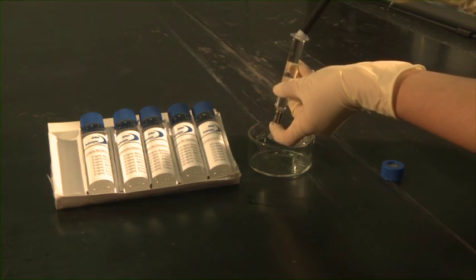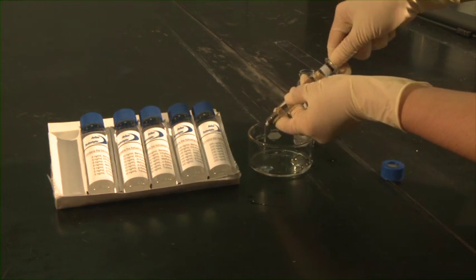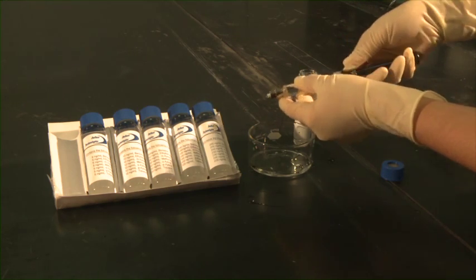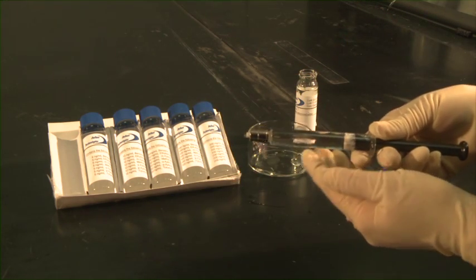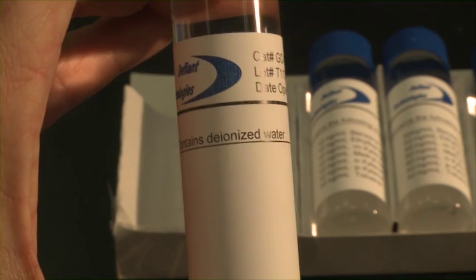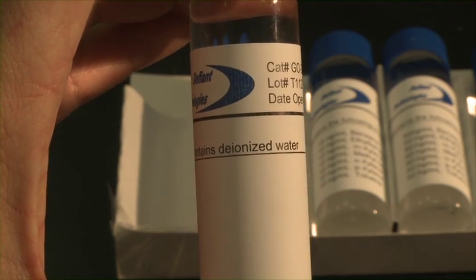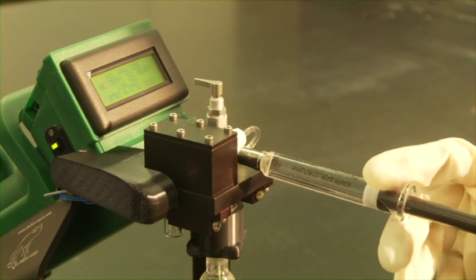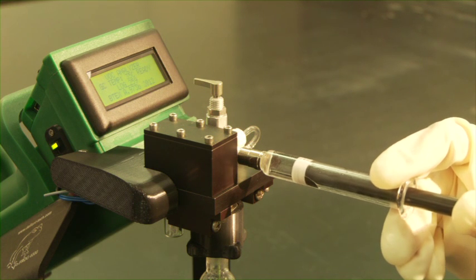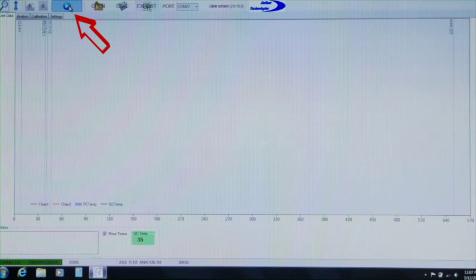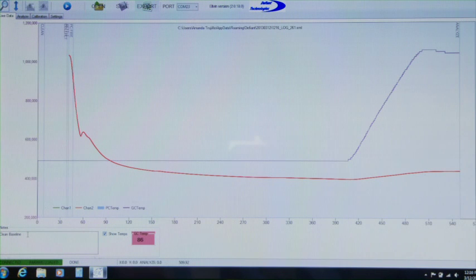After you have entered the analyte list, it is good practice to run a couple of clean water blanks to make sure the instrument is clean and ready to go. Use the blank sample from the standards kit or use distilled water. Load five milliliters of distilled water into the Frog and click the start button in Elvin. The resulting chromatogram should have no significant peaks.